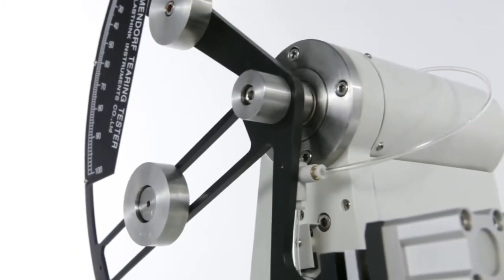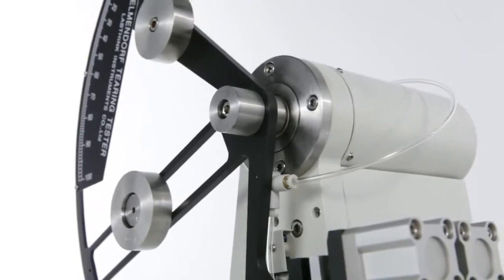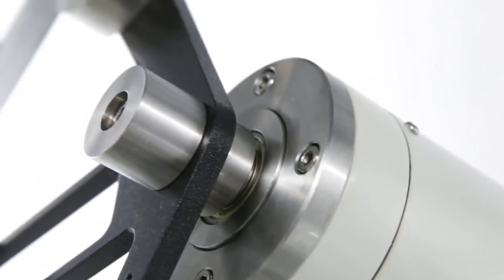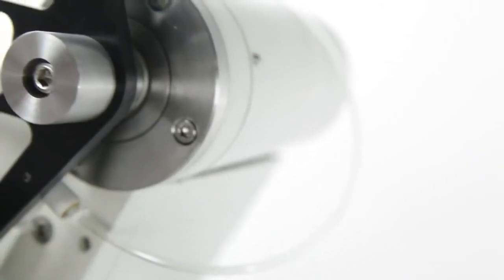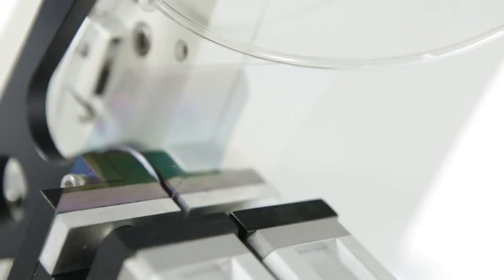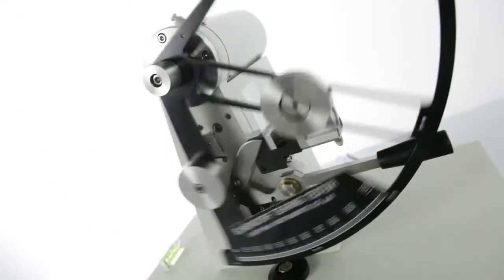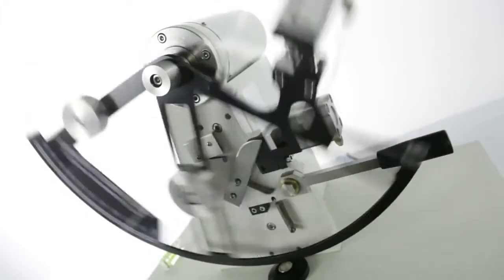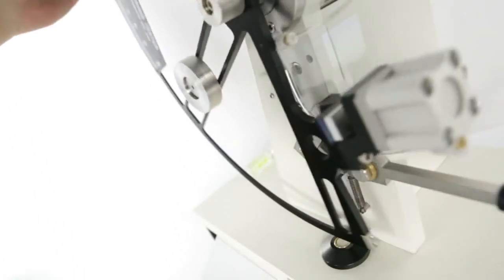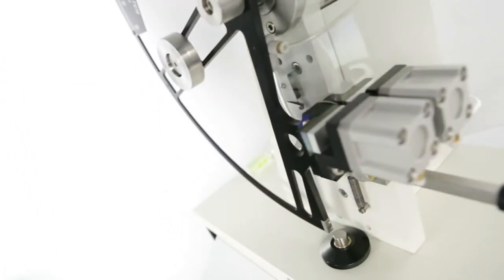The built-in high-resolution optical encoder measures the angular position of the pendulum during the sample tearing process and converts this measurement into tear units. This greatly enhances the accuracy and repeatability of test results.